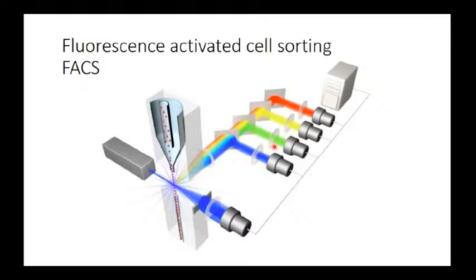We can also combine the data together. So I can form this two-dimensional histogram again, but with protein 1 and protein 2. So I have the signal coming from fluorophore 1 and fluorophore 2. When the cells are here, it means that these cells are expressing both proteins because they are giving a high signal on the first detector and on the second detector.